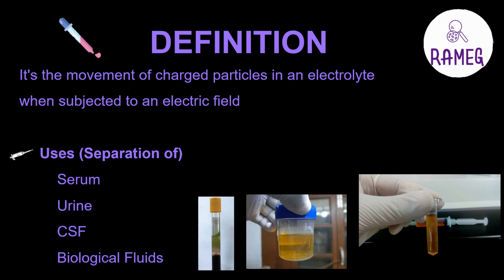As proteins are some of the charged particles, they are mostly used in electrophoresis, and some of the sources of proteins include serum, urine, cerebrospinal fluid and other biological fluids.